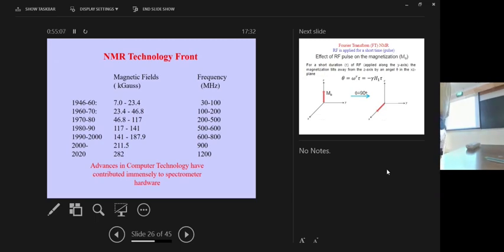55 crores. Recently got the quotation, 55 crores. Okay. Now, how much will this be? 1.2 gigahertz. Is it not possible for us to? We cannot afford it. Extremely expensive. But the technology is also very different.